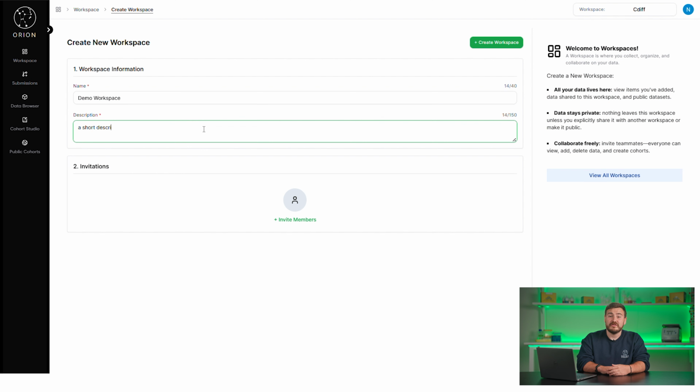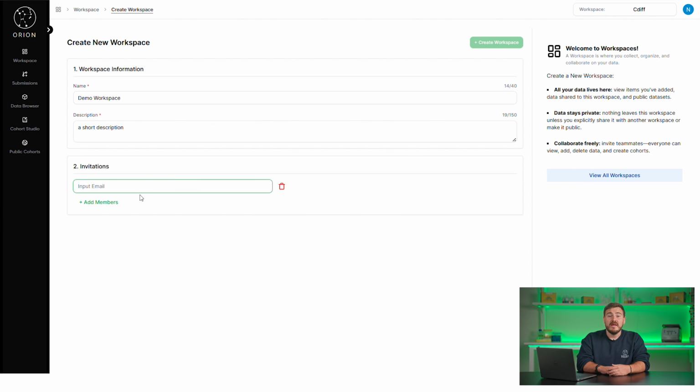You will also see a summary of all of this over here on the right, and we can also add invitations to collaborators here via their email. Inviting others to your workspace will allow them to see their private data pertaining to that specific workspace, and depending on the role you give them, interact, utilize, and manage that data with varying degrees of freedom. You can also invite users later beyond this workspace creation page and manage their roles independently. We will show all that later on. For now, let's not include any on this round of invites, and let's click Create.